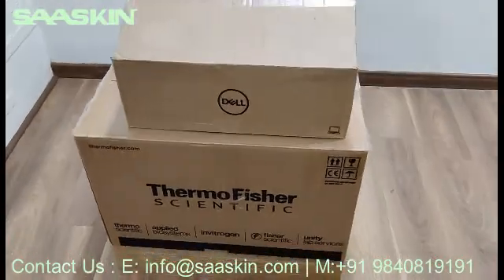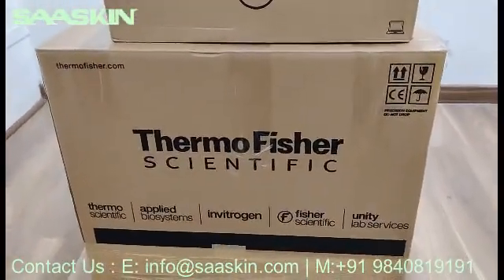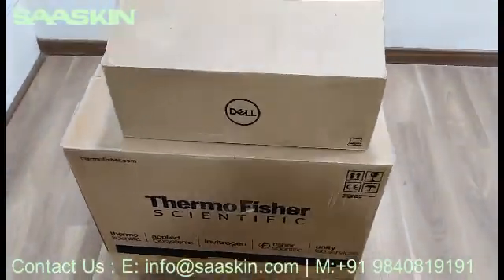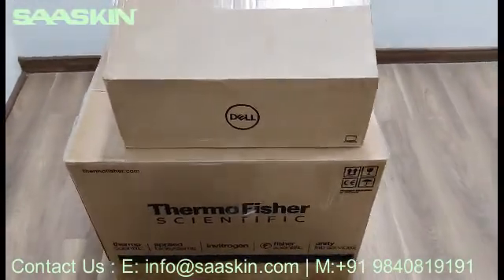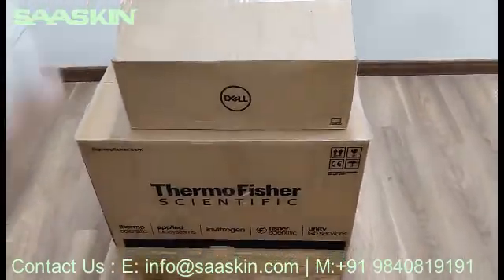Hi, today we are going to see the unboxing of Thermo Fisher Scientific QuantStudio 5 PCR instrument. This is how the box looks like. This is typically a 96-well instrument with a 0.2 ml block. This comes with the laptop monitor model. This is the complete two boxes that we received.